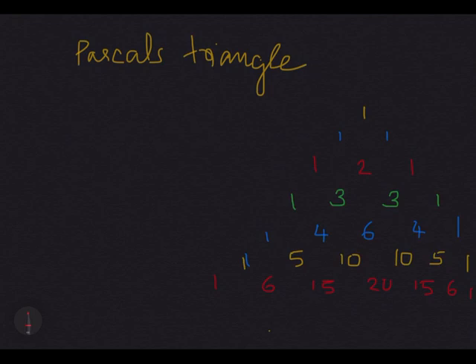So if a signal splits into 2, the intensity ratio will be 1:1. This is a doublet. If a signal splits into 3, we get a triplet.